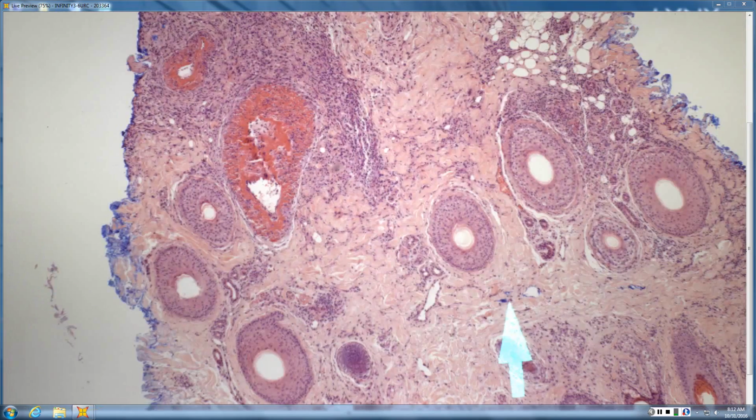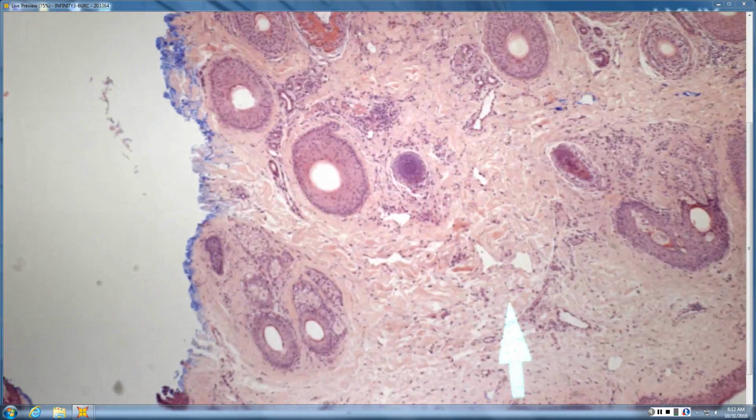You put it in saline for frozen, or? No, you can put it in formalin. You just don't want it to go through xylenes and alcohols. It's really the xylene that removes lipid. Alcohol dehydrates, xylene or histoclear removes lipid. If you put it in formalin, though, it likes to slide off the slide when we go to hand stain it. So saline, or bring it down dry and fresh. Better. Okay. We can do it, it might take us a lot longer.